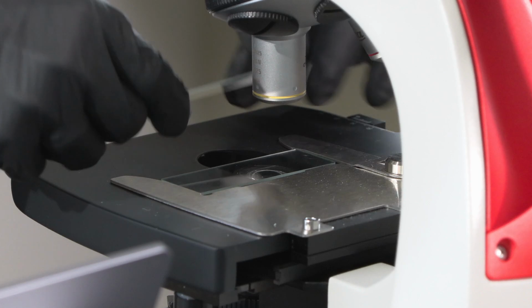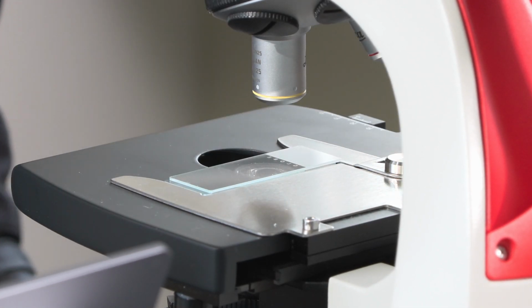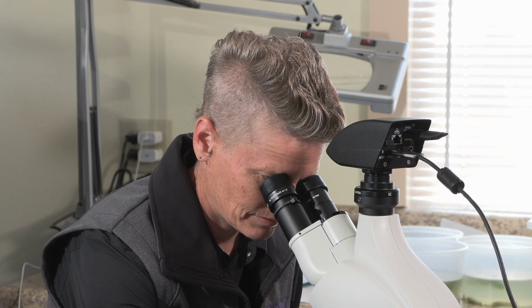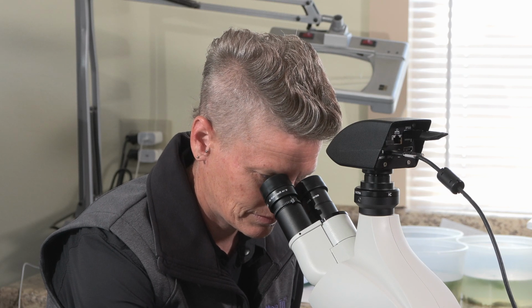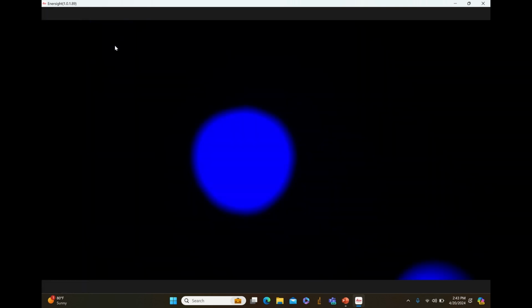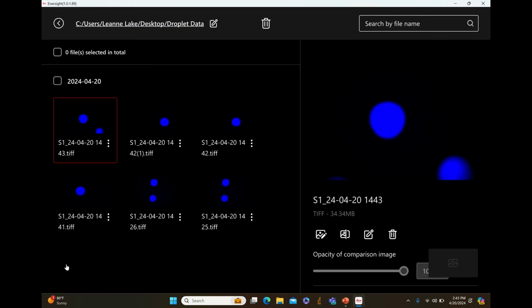Before acquiring the images, place the droplet rod or slide on the empty microscope slide in the top of the specimen table. Adjust the table as needed to get the rod or slide under the lens, and adjust the height appropriately to focus in the images. When ready to capture an image, select Acquire on the top left side of the monitor. The camera will make a beep sound when the image is captured. Acquire at least 10 clear droplet images for each station, or enough images to capture approximately 200 droplets.